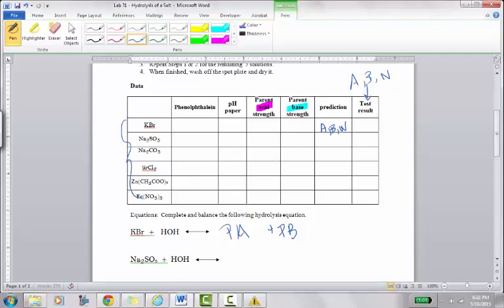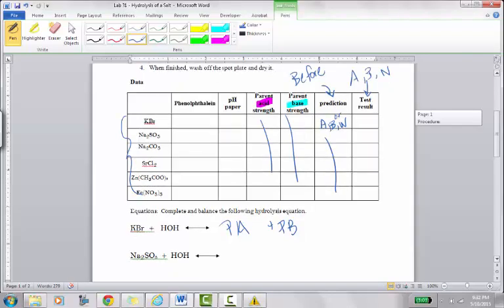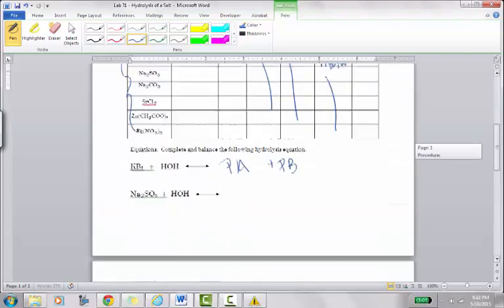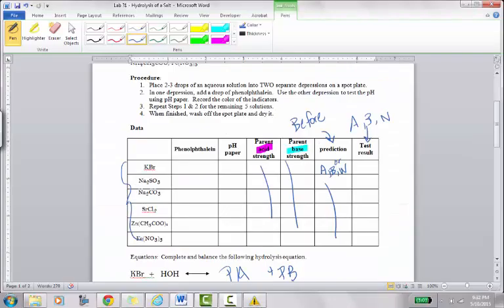You're going to put one of those 3, acid, base, or neutral, into this column. This is before you even start the lab. So when you come into class, I expect to see this column, and this column all filled out. And I'll take a look at that, and then I will send you back into lab. So in order to do that, those 3 columns on the lab, if you fill out these equations down below, you'll have a good portion of the lab already completed, even before you take the data in the lab.